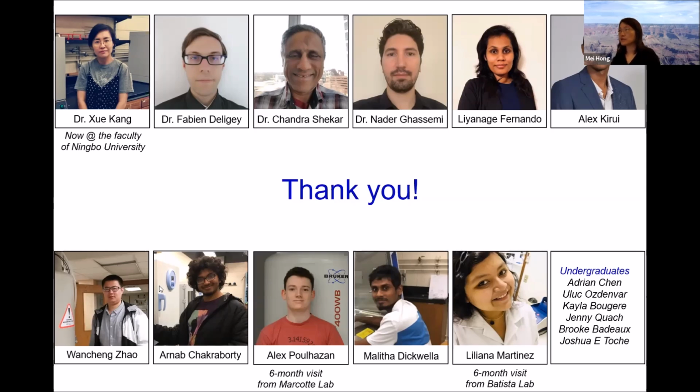The first question is, how do you label fungi cell wall? Our first samples were purchased directly from a labeling company, but all the later samples, we prepare freshly in the lab. It's very easy. You just feed them with carbon-13 glucose and the nitrogen salt. Depending on the fungal species, they have different salts to use.